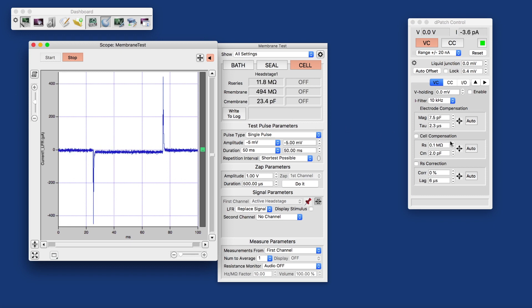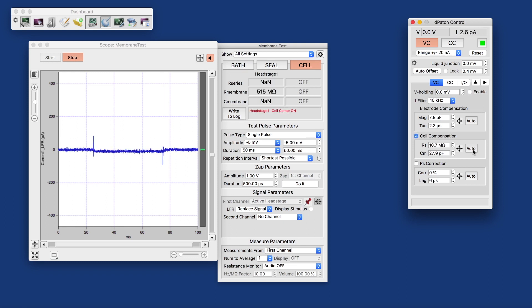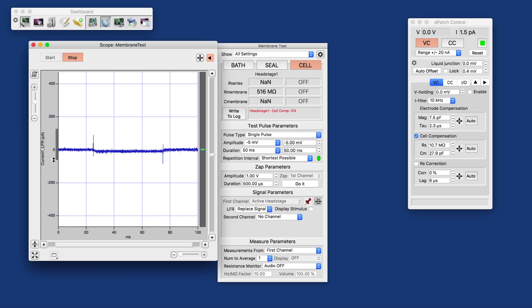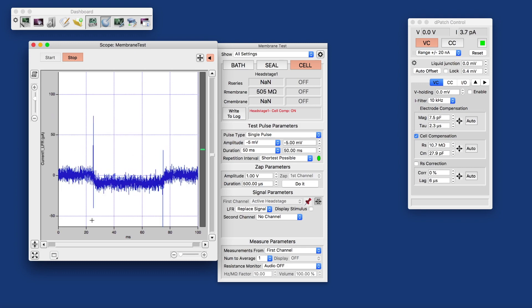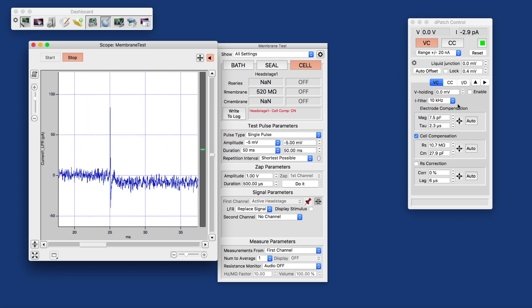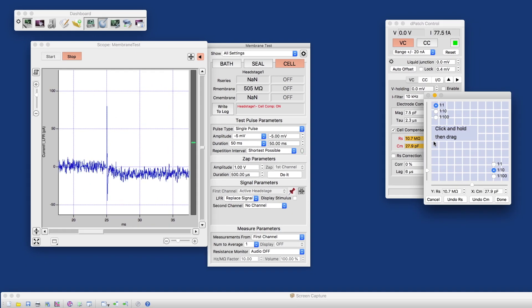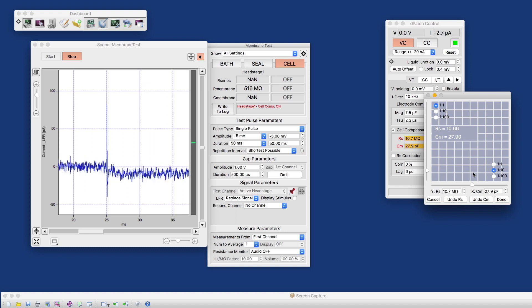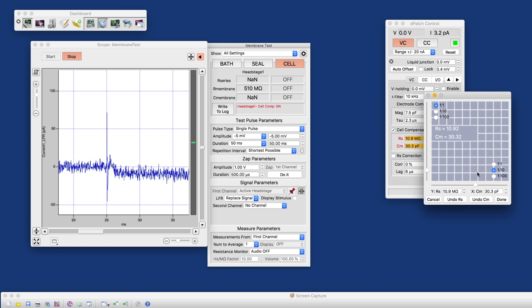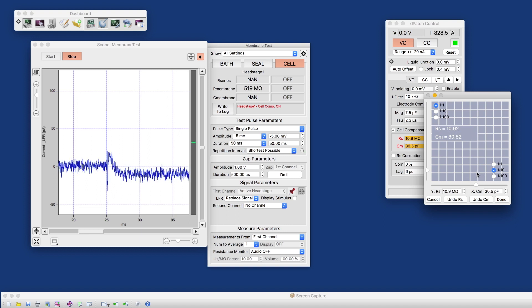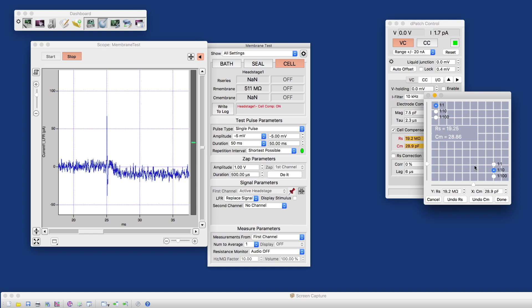And again, for the whole cell compensation, we just click the auto. And look what happens. It almost disappears. And again, we can manually touch that up if we like to the point where we want it.